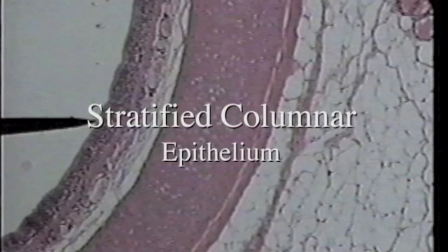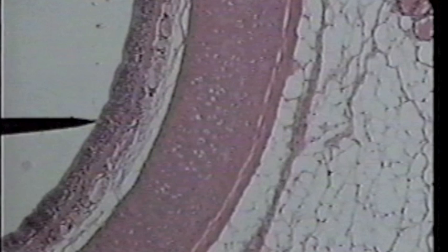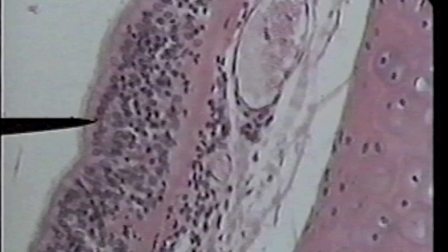This slide is the trachea at low power. The tip of the pointer is on the epithelial layer of the trachea. This is actually a layer of stratified columnar cells, but you can't really tell that this epithelial layer is many layers of columnar cells on low power. We will now move to the same slide on high power so that we'll be able to see.